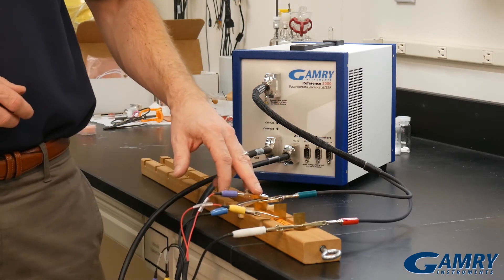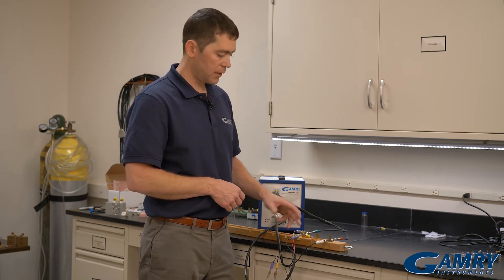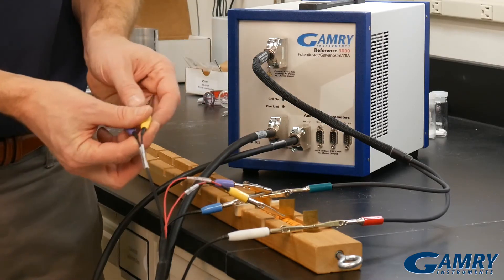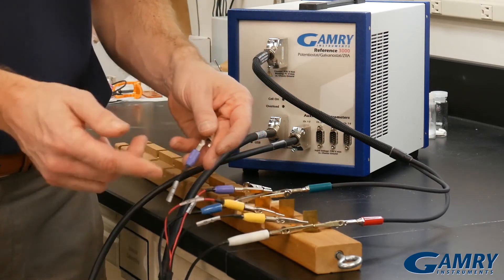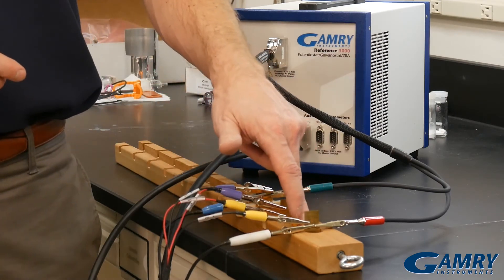I'm going to connect the purple to the positive end — the cable is labeled that way. I connected the yellow to the negative end of the first cell. Now I connect the second channel to the second cell: yellow to the negative end and purple to the positive. So now I can characterize the second cell.